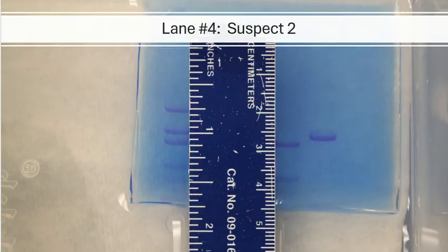All right, in the next lane, we've got suspect number 2, and suspect number 2 just as well. We obtained their DNA, we amplified it, we broke it up into fragments, and this person fragmented in 2 different locations. So it looks like this person fragmented here, and you can make that measurement, and that person fragmented there as well. So you can make that distance and judgment call just the same. Like all the rest, you need those centimeters because those centimeters will help you identify the base pairs of these fragments that are showing up on the gel.